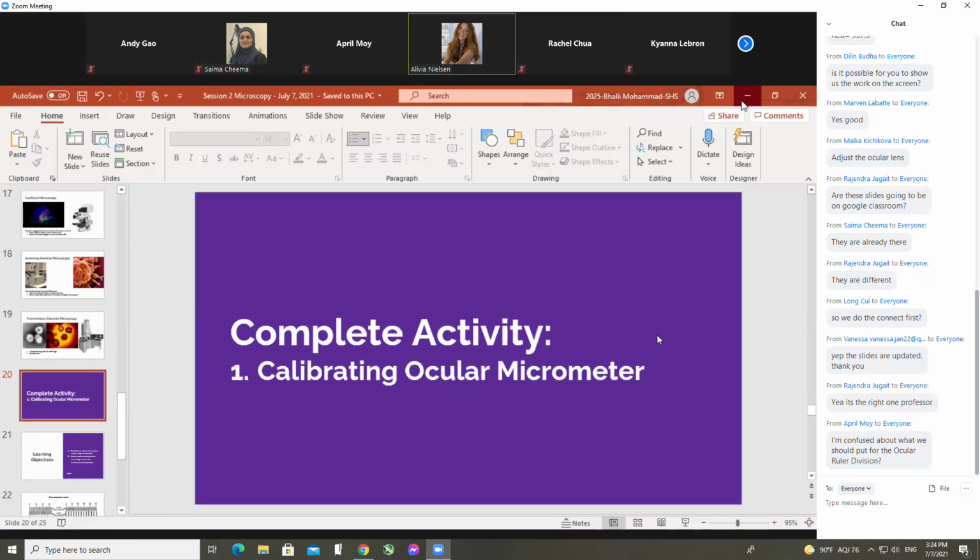Professor, I have a question. I see that you posted the two short videos about the agar plates. Are we supposed to melt the agar in a pot? Yes, there's a rack that came with the kit, so you can put your agar test tubes in that rack and then place it into a pot. It's not going to get contaminated because this agar is sterile. You can rinse the pot afterwards and there's no issue with that.